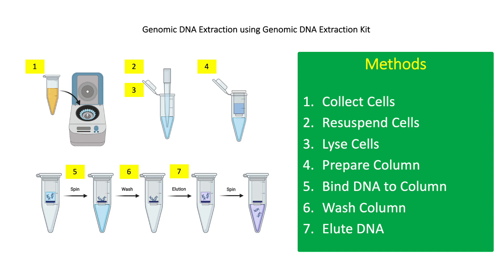For step 6, transfer the column into a new collection tube and add 500 microliters of wash solution to the column. Centrifuge at 6,500 g for 1 minute. Transfer the column to a new collection tube, add another 500 microliters of wash solution, and centrifuge at 12,000 g for 3 minutes to dry the column.